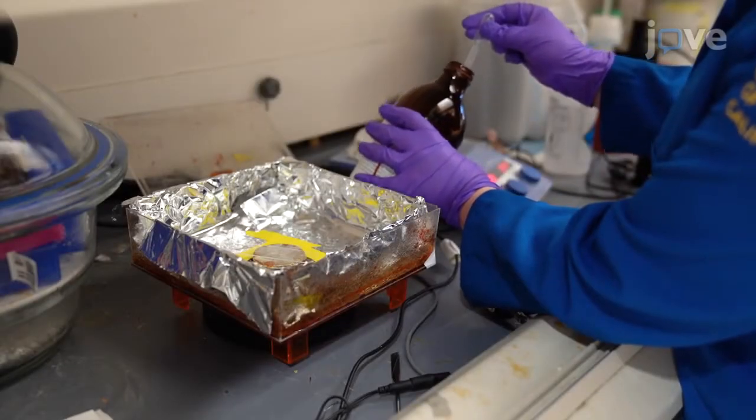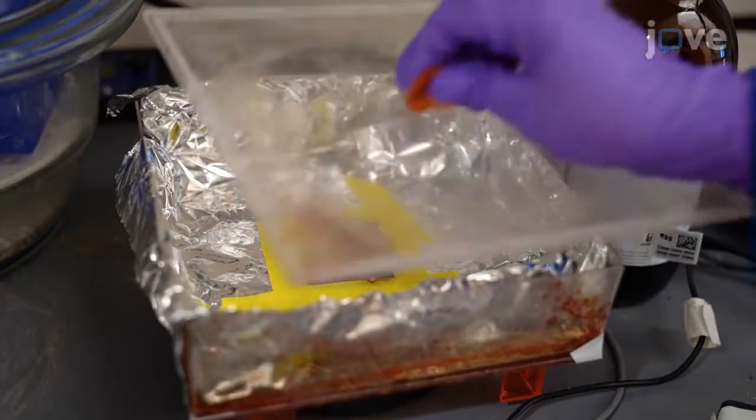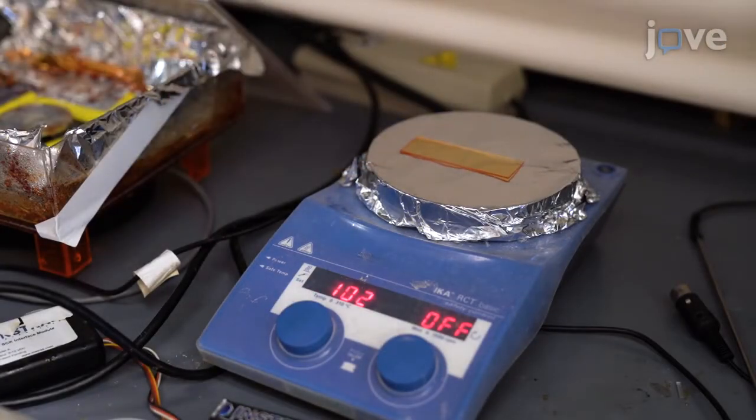Begin by dropping small drops of the positive photoresist onto the aldehyde slide using a disposable pipette. Spin the slide at 3000 RPM for 30 seconds using the spin coater. Then place it on a 100°C hot plate for 1.5 minutes to cross-link the photoresist.